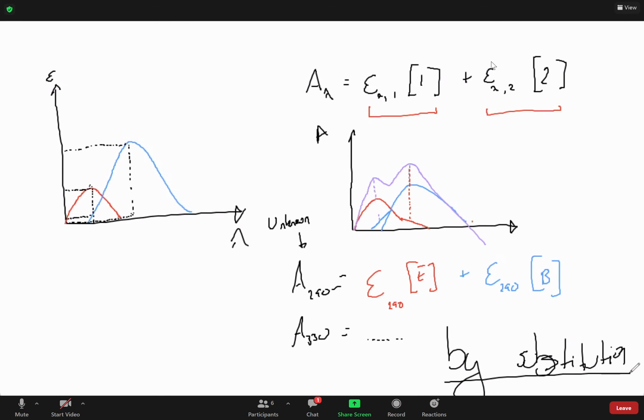There's 100 good tutorials on how to do this. It's part of the core A-level course in the UK, so there's a lot of good resources for that. And you can also just use an online equation solver. There's plenty of resources online where people have programmed it in, so you can just put in your absorbance values, your concentrations, and your unknown values, and it'll solve it for you, and I will never know.